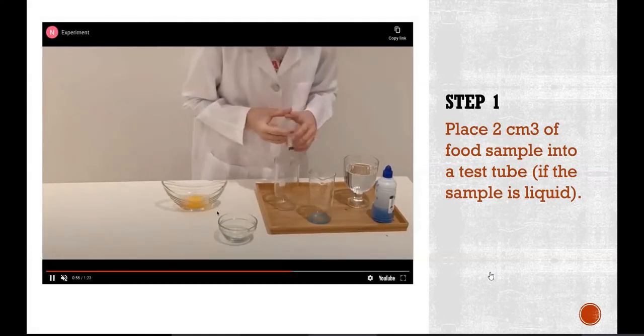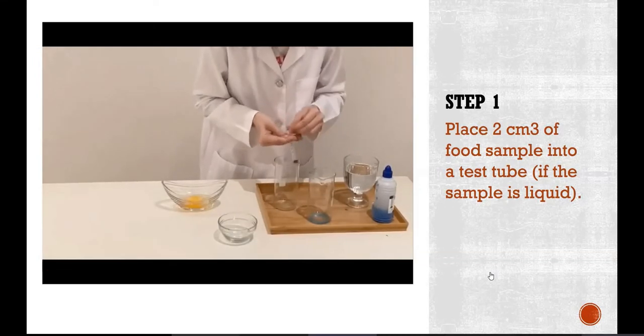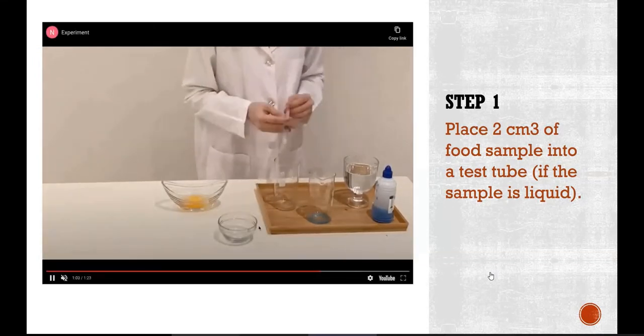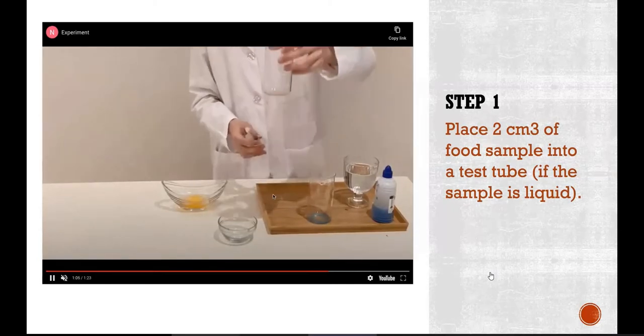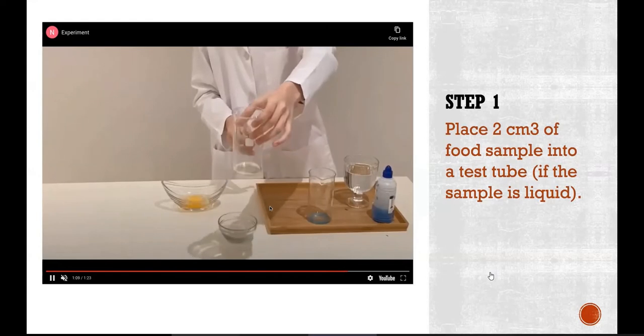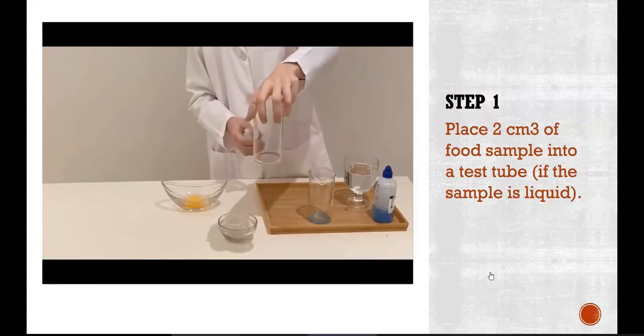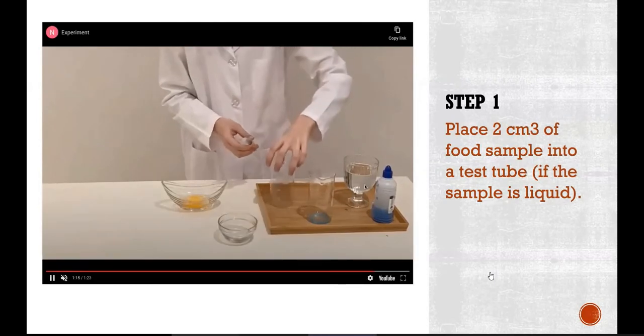And then you dispose of it inside this empty beaker that I was holding earlier. And then you're going to notice me, again, I'm giving you a close up. You're going to notice that I will be cleaning and sanitizing the syringe in this distilled water, in the glass of water that I have on the side.